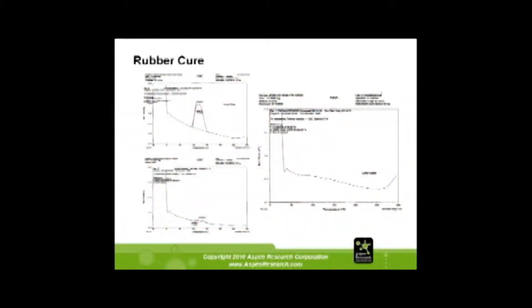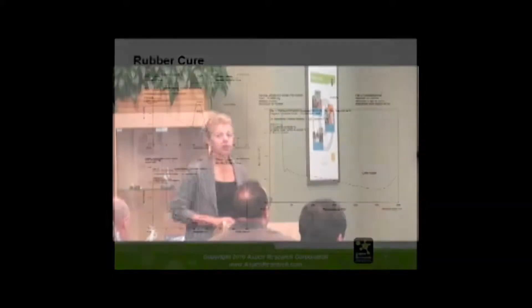Here are some rubber cure results. This is an exotherm — a silicone rubber curing. The customer asked us to run it uncured, then they were supposed to have cured the material and we ran it again. As you can see, there was still some uncured material in the sample — the curing exotherm is visible here. So they cured it once more, and now you have a flat line, meaning everything is fully cured.